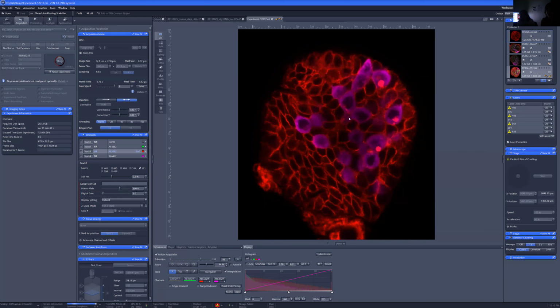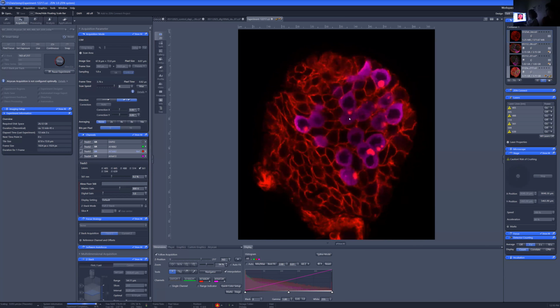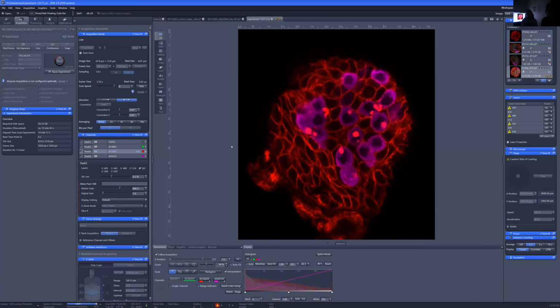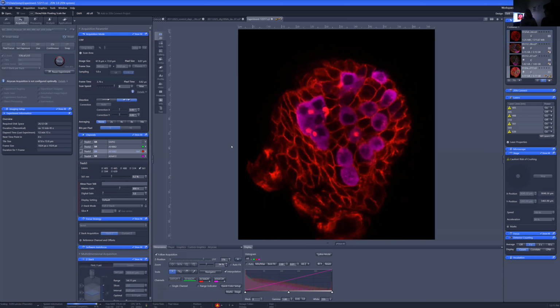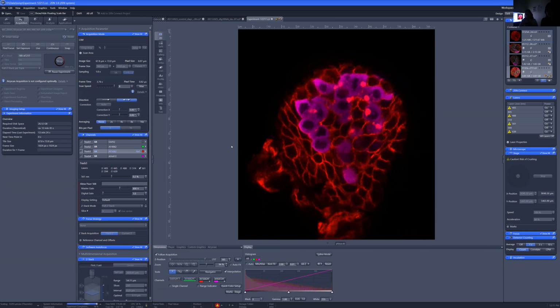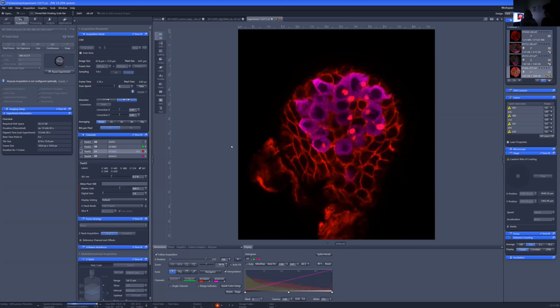So we are 93% done with this experiment. You can see it's keeping track down here at the bottom. Once the image finishes acquiring, I'm going to move to another sample on the scope, reset the top and the bottom of my Z-stack, check the levels of the laser to make sure everything looks good, and then start the next acquisition.